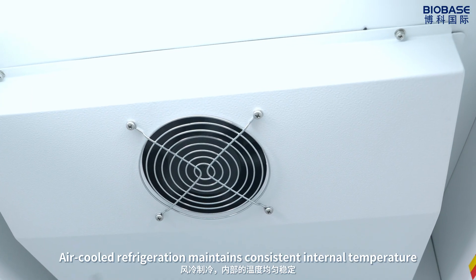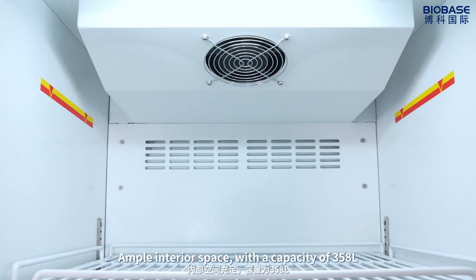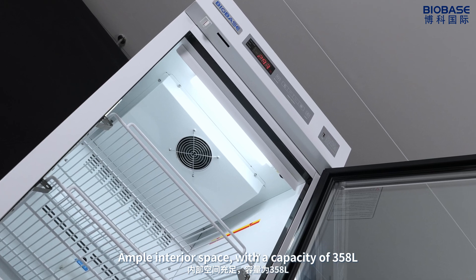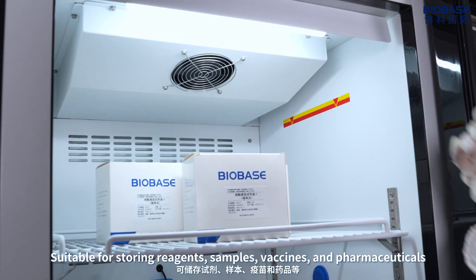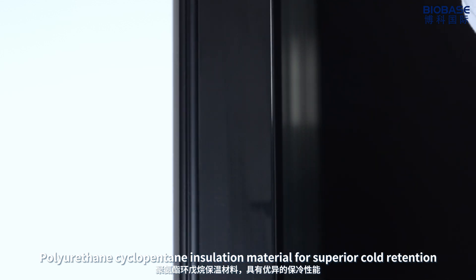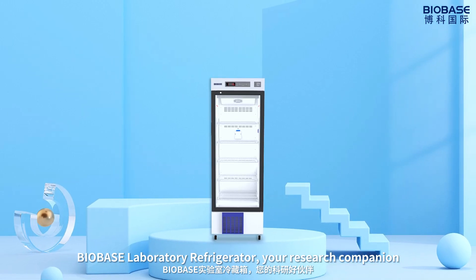Air-cold refrigeration maintains consistent internal temperature. Ample interior space with a capacity of 358 liters. Suitable for storing reagents, samples, vaccines, and pharmaceuticals. Polyurethane cyclopentane insulation material for superior cold retention. BioBase Laboratory Refrigerator — your research companion.